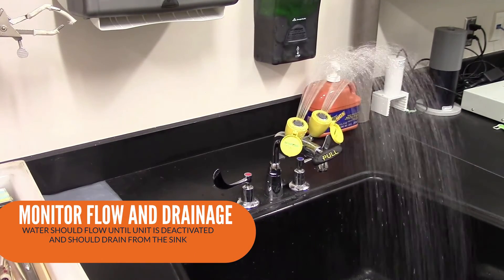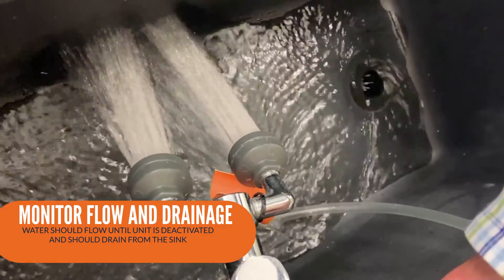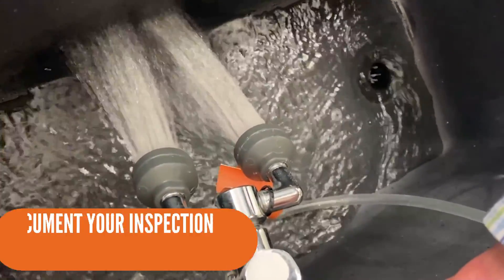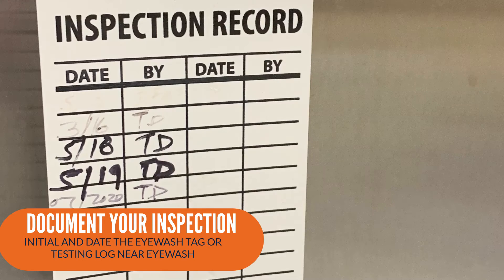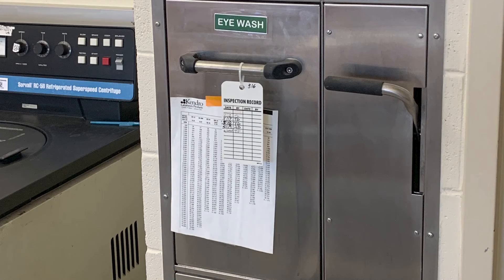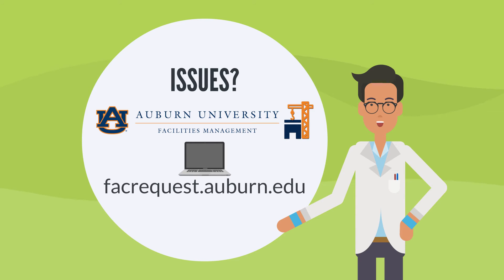Ensure that flow continues until deactivation. Then, examine if the water drains from the sink. Lastly, document the inspection and performance tests by initialing and dating the eyewash tag or an eyewash log near the eyewash. If you encounter an issue, submit a work order with Auburn University Facilities Management. The link to submit a work order is at the bottom of the screen.